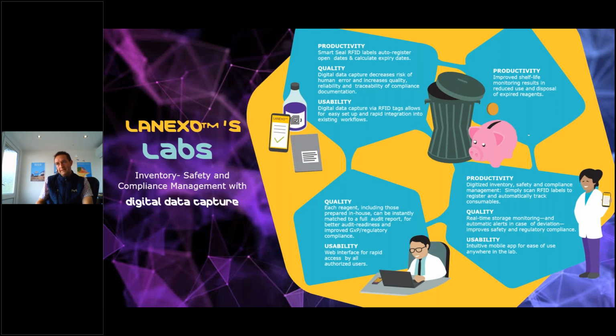It's a very big problem getting compliance in terms of using the system. The usability isn't always where it needs to be, and that can create a lot of stress. It also causes people to not want to use it, and therefore people don't use systems. With one customer, they were trying to put a LIMS system in for 2 years, and they said scientists will not tolerate this because the interface is just not right. They just don't want to use it.